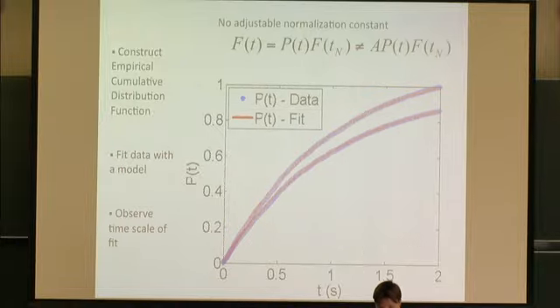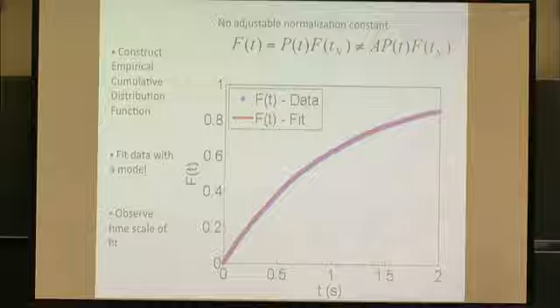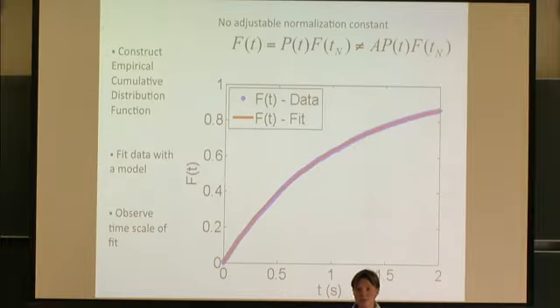But the take-home message here is that you need to fit a functional form for the unfolding probability which is normalized to 1 at infinity and not your time window, and you're not really allowed to add an extra free parameter to normalize this distribution. You need a distribution where the unfolding probability that goes to 1 at infinity is consistent with the conditional probability on the time window that you do measure. This is a small point, because people in other groups don't do this, so we wanted to make a point that those two things are not equivalent.